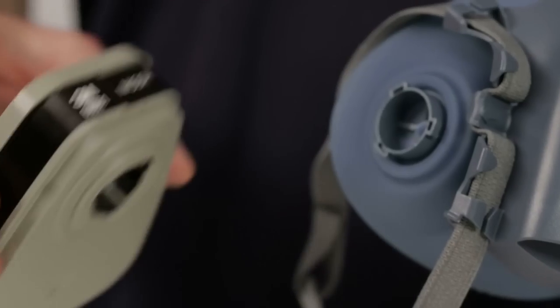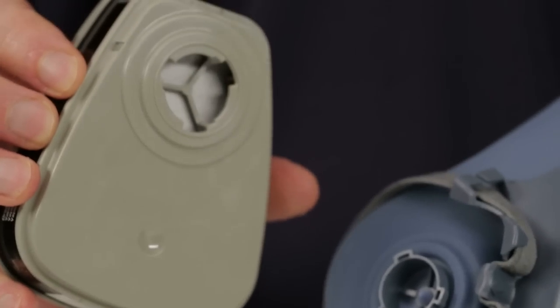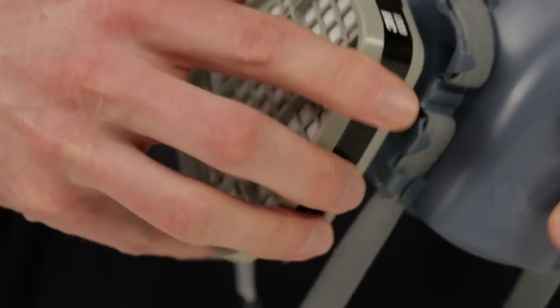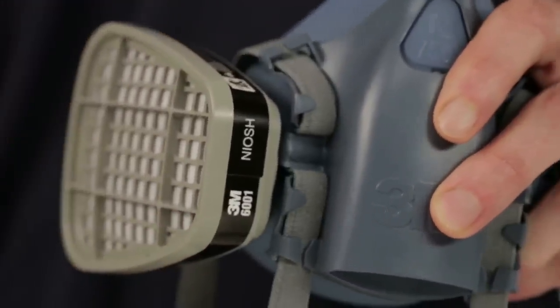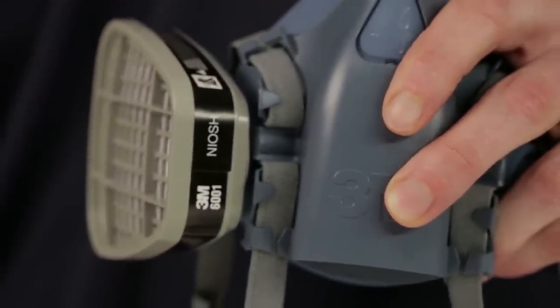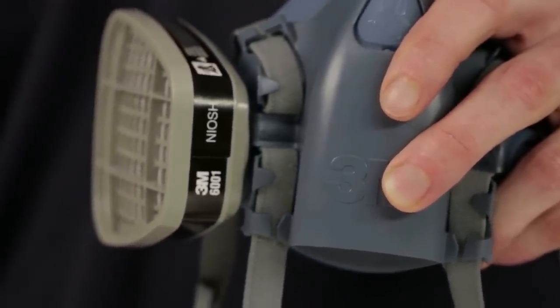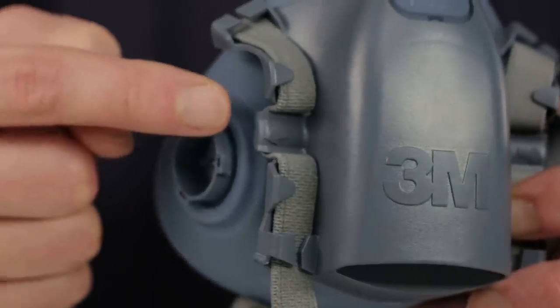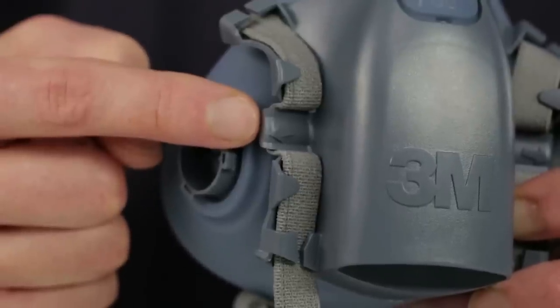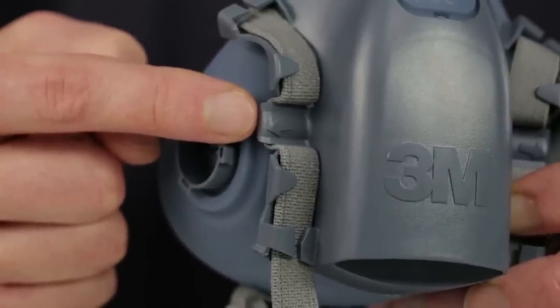To attach the chemical cartridges, simply align the mark on the cartridge with the small bayonet lug on the face piece and push together. Rotate the cartridge clockwise one quarter turn to stop. Follow these instructions for the second cartridge. All 3M half-face pieces feature a guiding mark to help users align filters and cartridges properly with the small bayonet lug.